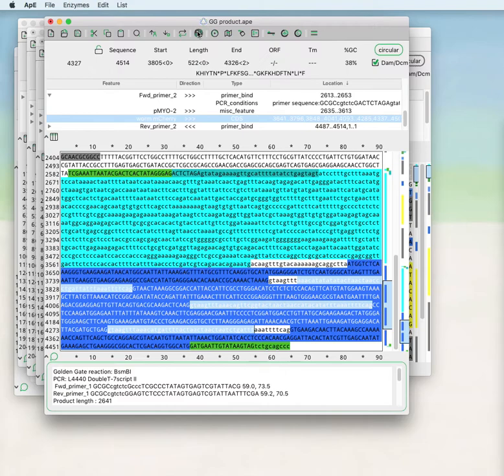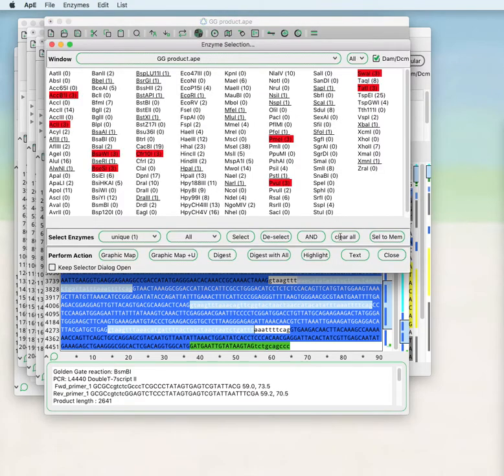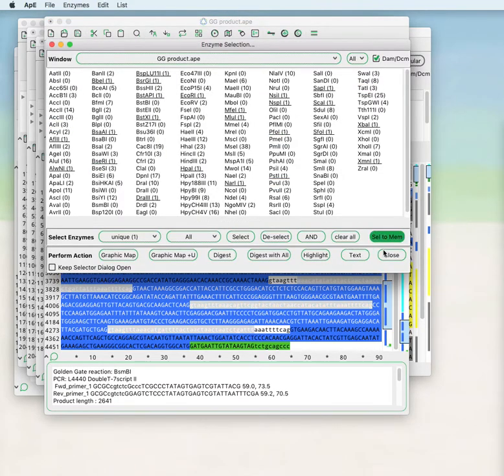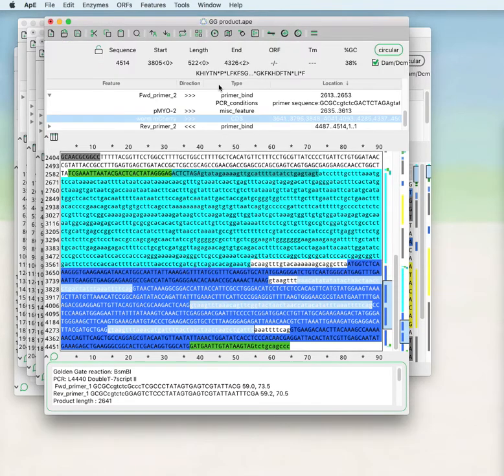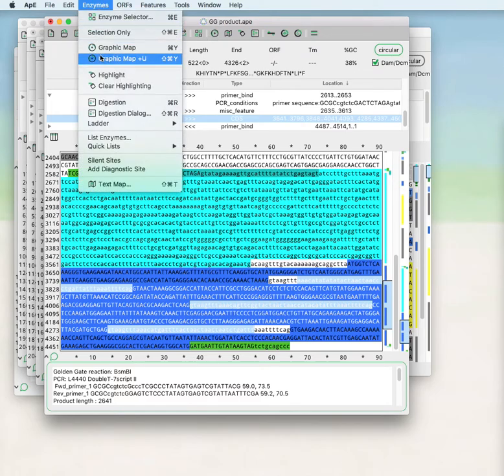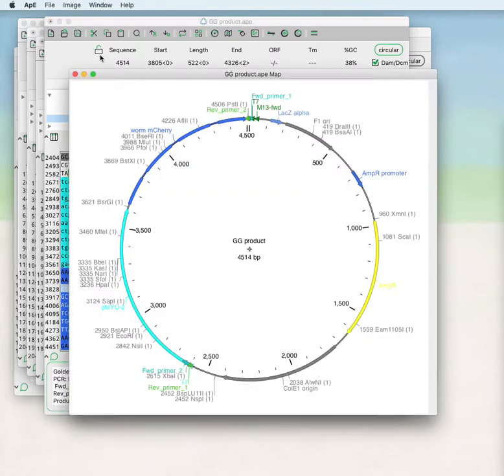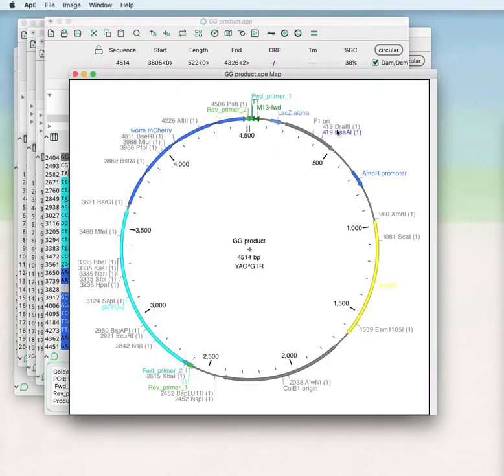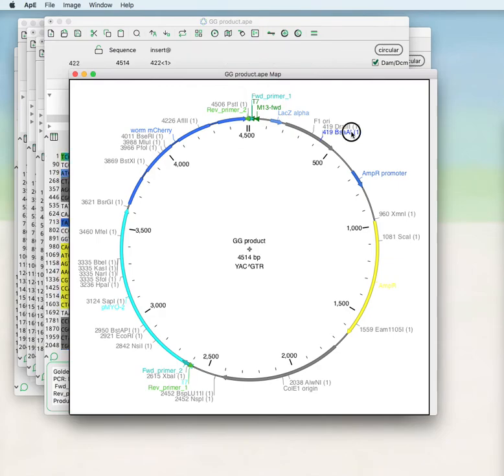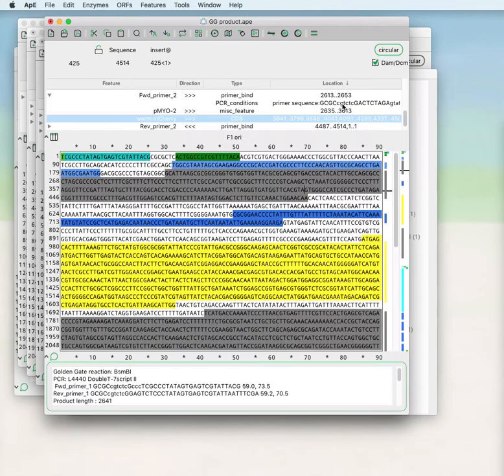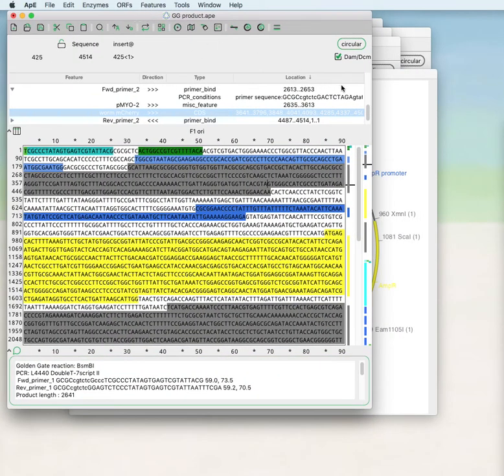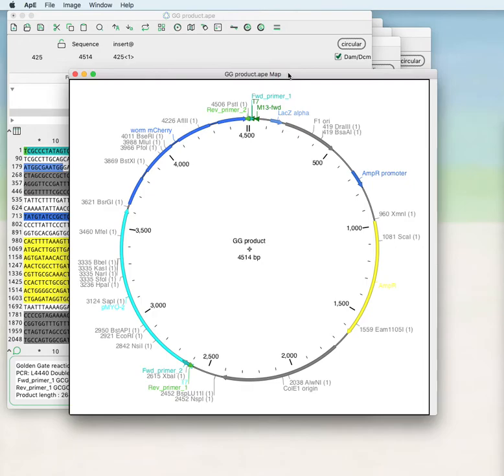If you have no enzyme selected, if you do enzymes graphic map plus U, it will show the unique enzymes even if they're not within the selected set. These are live linked back to the sequence, and if you double-click it will raise the original window that this graphic map refers to.